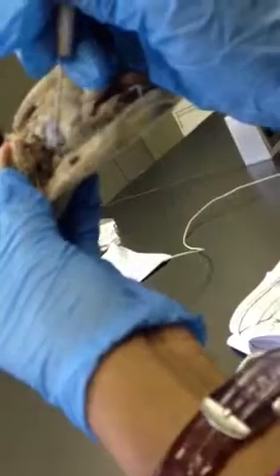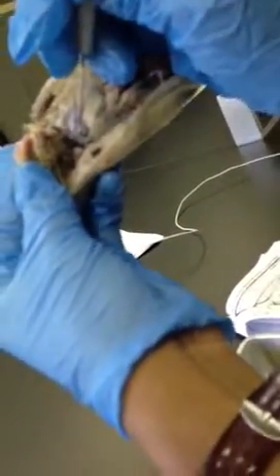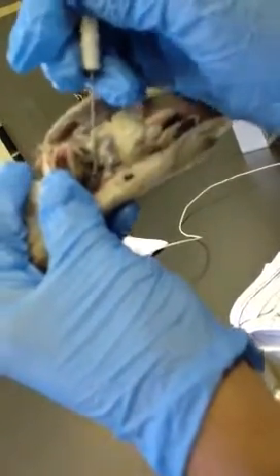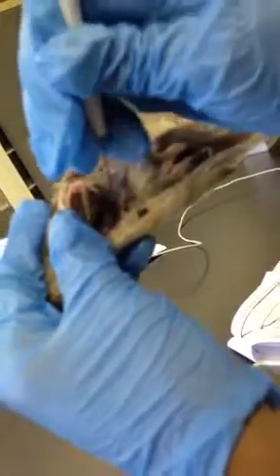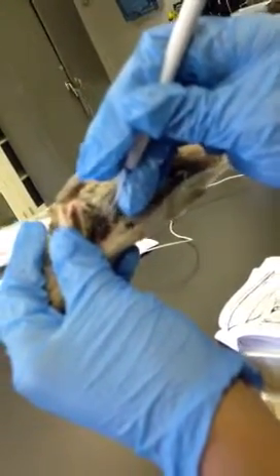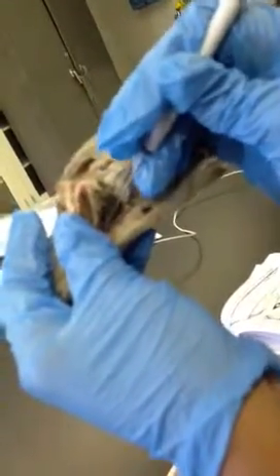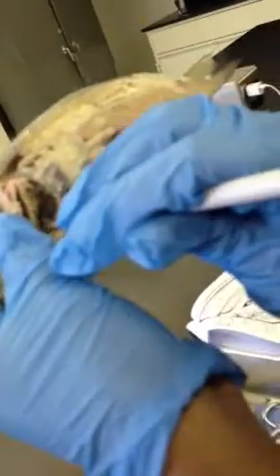So, we have four chambers. First we have the sinus venosus. It's like a chamber back here behind the heart. And then the sinus venosus feeds into the atrium. And the atrium, which is here, feeds into the ventricle. Right there. So atrium, then ventricle. Then that feeds into the bulbus arteriosus, which is here. And then all of those four chambers feed into the ventral aorta, which is here.